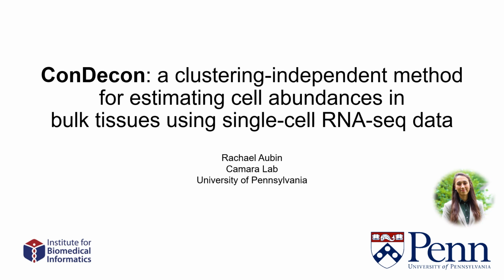Today I'll be talking to you about ConDecon, a clustering-independent method for estimating cell abundances in bulk tissue using single-cell RNA-seq data.